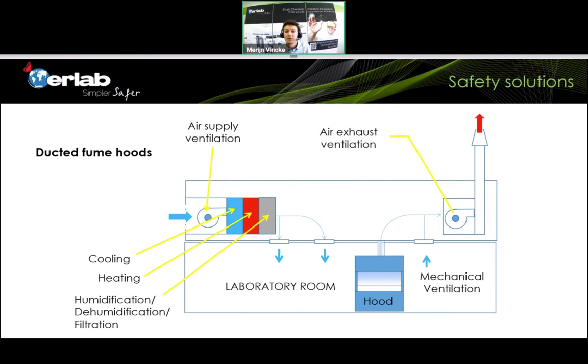So there really is a mechanical ventilation, and you really need to connect that hood with a system in the infrastructure of the building. What is really important, and really something that I would like to tell through this webinar, is the fact that often when we think about risk assessment, we think only about the risk that we are exposed to in the lab. When we talk about risk, there is not only a risk in the lab, there is also a risk outside the lab. All the air that we extract to the outside will be released in our atmosphere. So there is also a risk outside the laboratory.